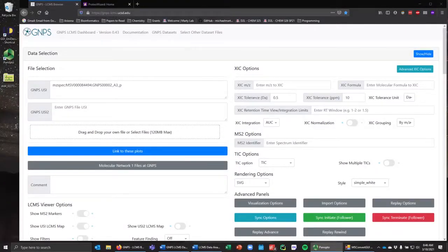Hi, I'm Michael Marty, and I'm an assistant professor in the Department of Chemistry and Biochemistry at the University of Arizona. I'm going to be showing you today how to use the GNPS LCMS Dashboard for analyzing LCMS data.